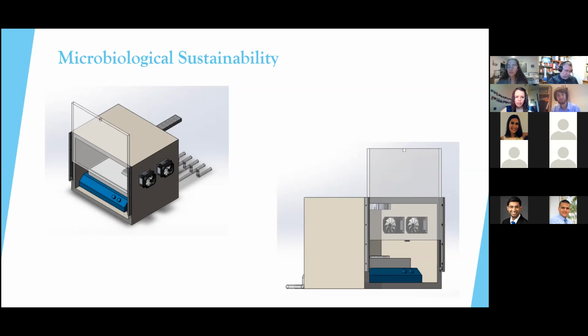Oh, sorry, the frame is made of extruded polystyrene, mostly. And then an orbital shaker and 2 Peltier modules. I think the benchtop would be able to support the system just fine. And the fan as well. Yes, and we didn't choose metals that were very dense. We chose aluminum and other materials. So we think it shouldn't be an issue, but we can definitely look into it. Thanks for bringing that concern up.